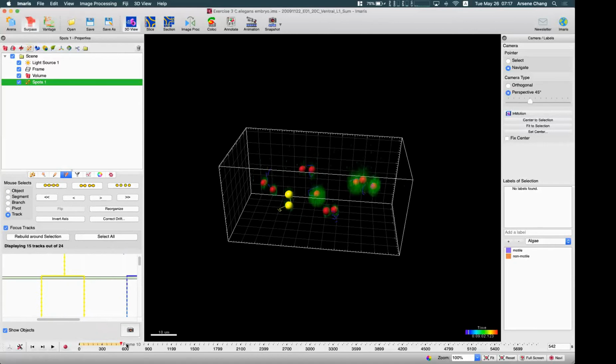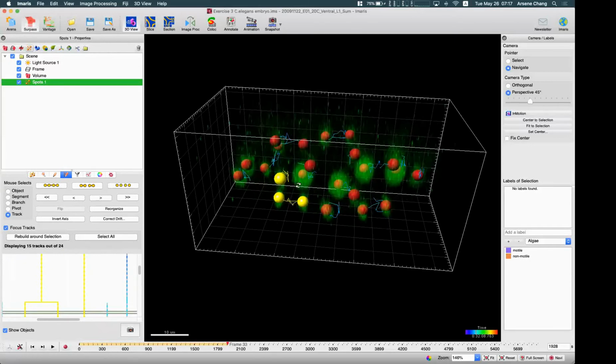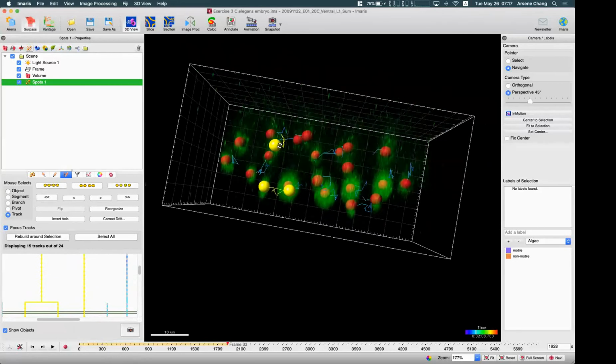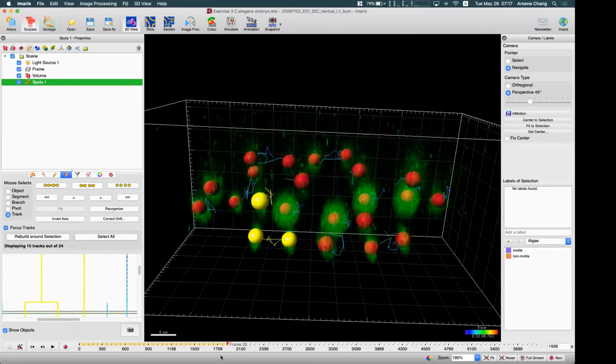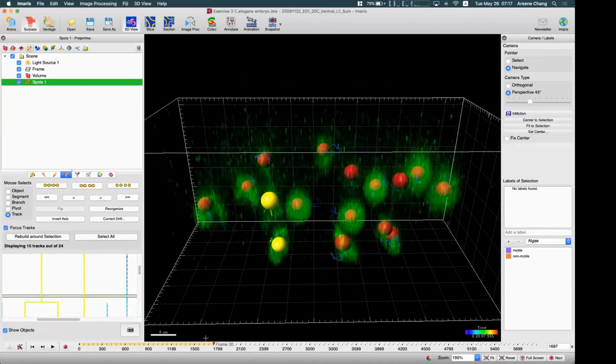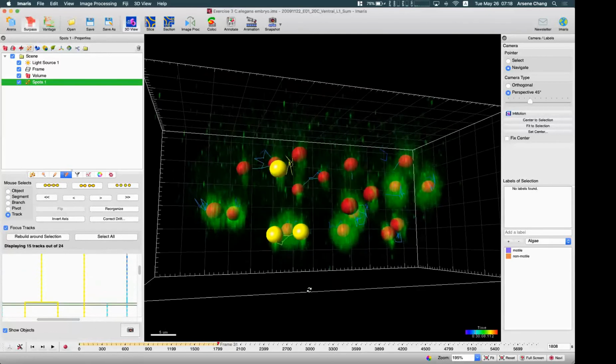Okay, so obviously you can see this one has been divided into 2, and then these 2 have been divided, one of them divided again here. And this one, we can check if this division is like one of them is missing or is it connected to another one.